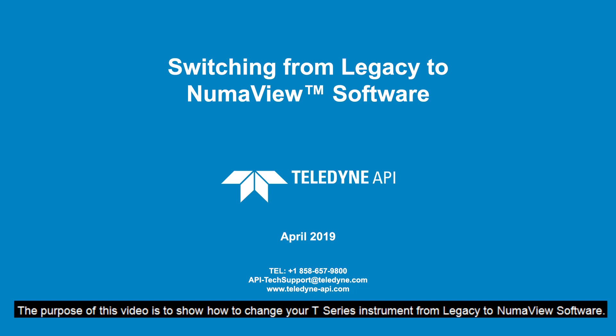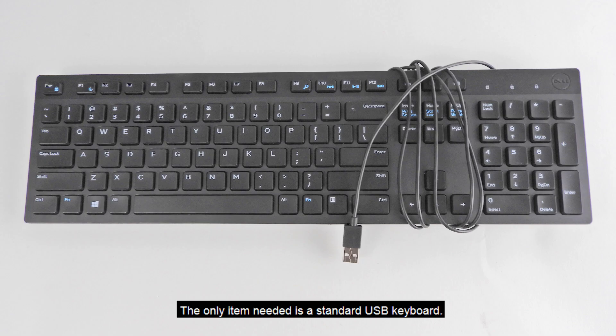The purpose of this video is to show how to change your T-Series instrument from legacy to NumaView software. The only item needed is a standard USB keyboard.